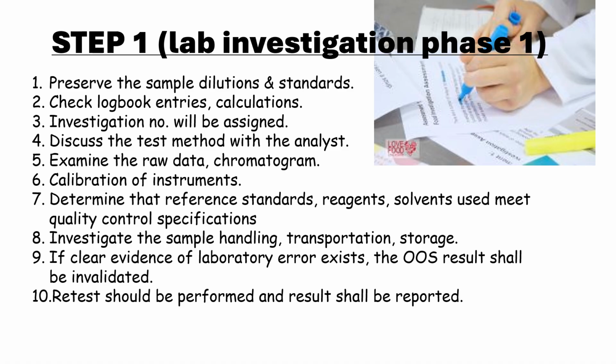And during this investigation, if the laboratory finds any error, then the OOS result shall be invalidated, and the retest of the sample should be performed, and whatever retest result is obtained shall be submitted and reported.